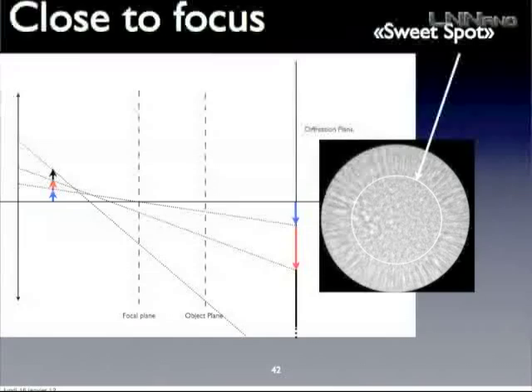And now I'm trying to look at what happens to the image of these three different objects that have all the same size. But now we are a little bit closer to focus, so it will, in a sense, magnify the effect a little bit. So this guy, which is very close to the axis, has an image with some magnification. The second one has a size that is increased, and this guy may have something like an infinite magnification.